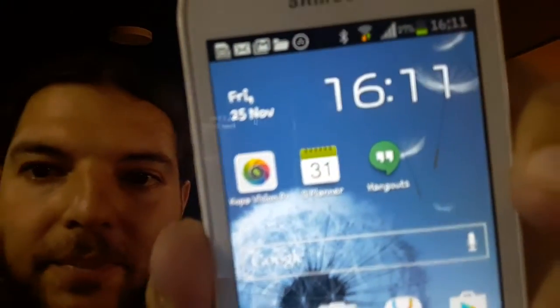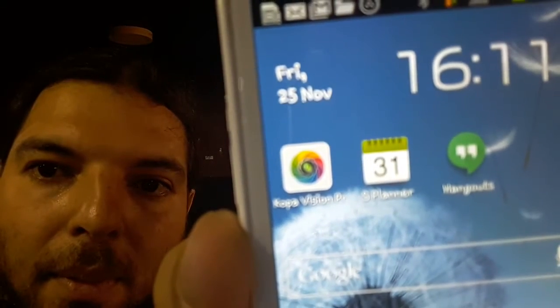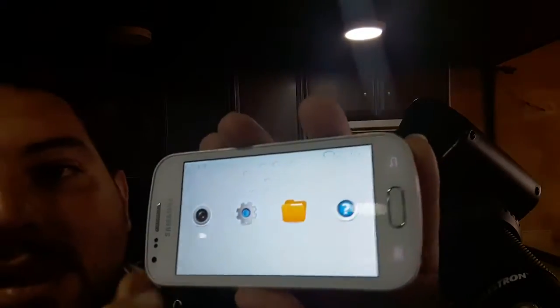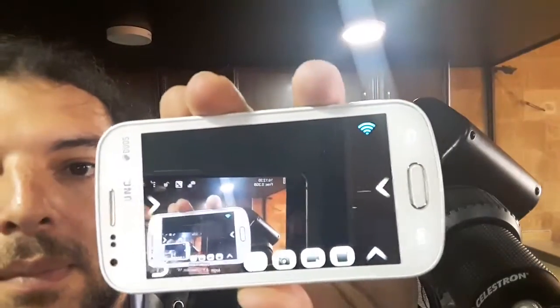On Android there's a same-interface app with a different name. I advise you to use the one called Copa — Copa Vision Pro. Find it on the Play Store. It has the exact same interface, with no difference, but the good thing is the file management: you can easily move your files to the SD card if you run out of space.